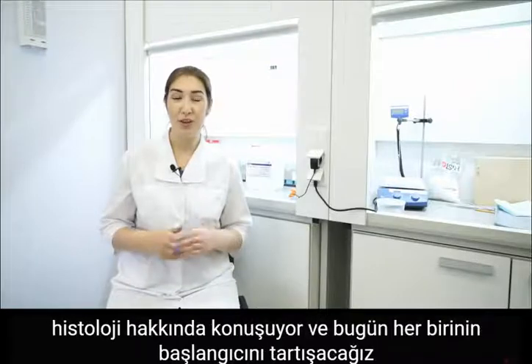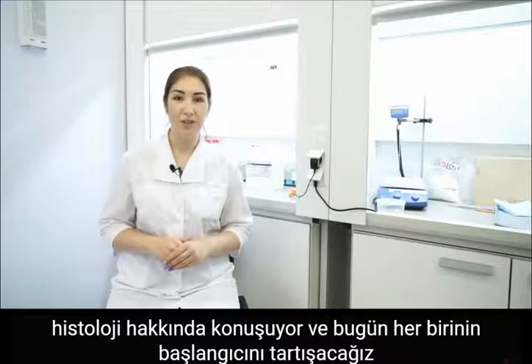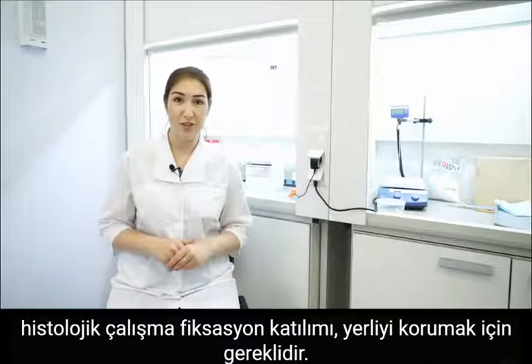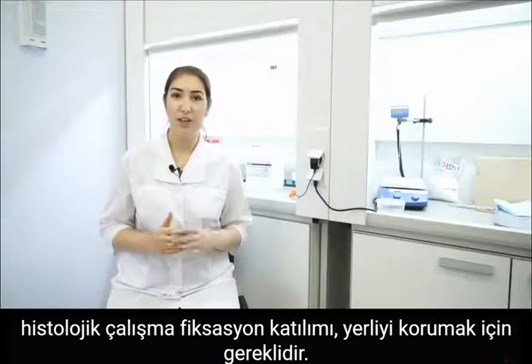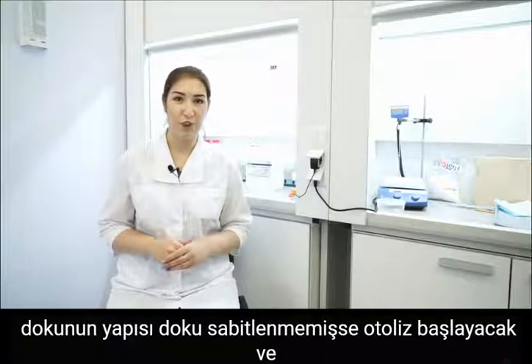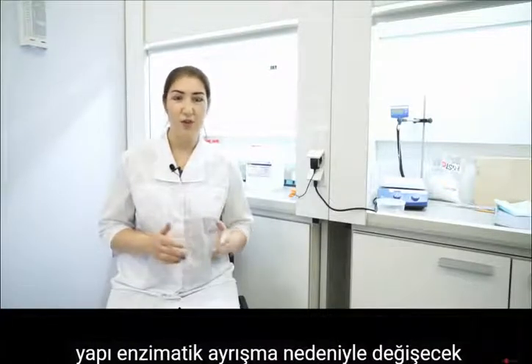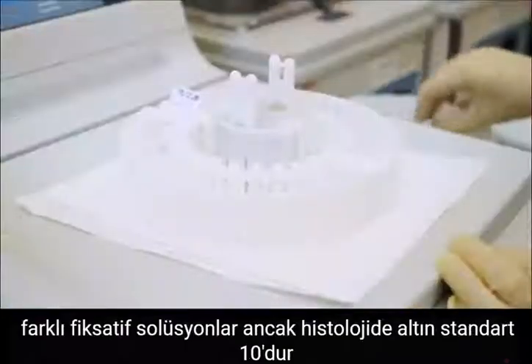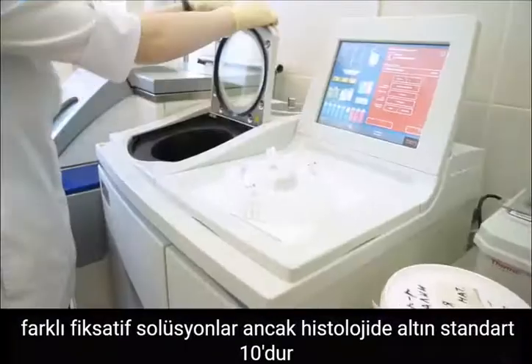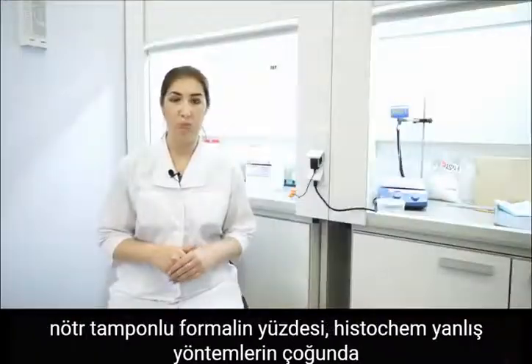We continue talking about histology, and today we will discuss the beginning of every histological study, fixation. Fixation is necessary to preserve the native structure of the tissue. If the tissue is not fixed, the autolysis will start and the structure will change because of enzymatic decomposition. There are many different fixative solutions, but the golden standard in histology is 10% neutral buffered formalin.